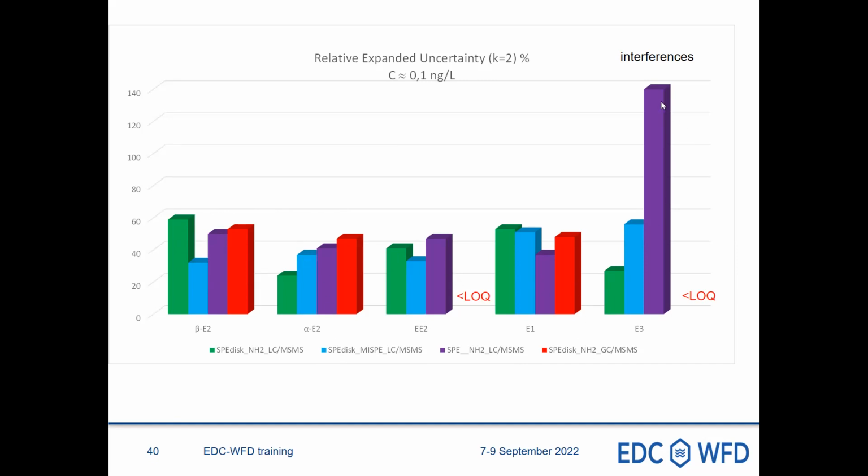And here for this lab, once again, we did not scratch any data. There was an interfering compound. We know what happened, but at this stage, we did not scratch it. We want to be honest with you: not everything is magic. We have some trouble like everybody.